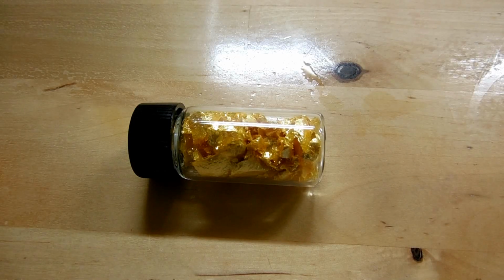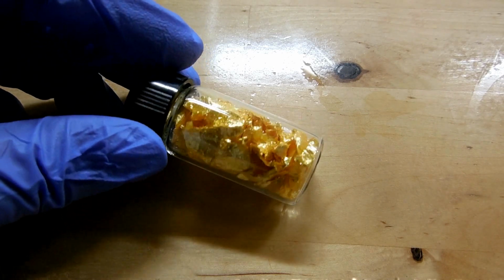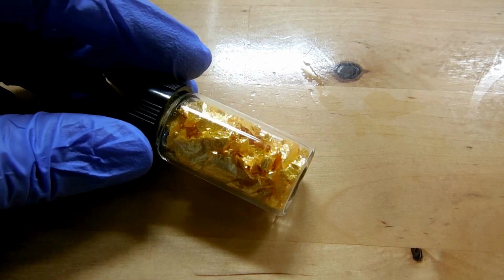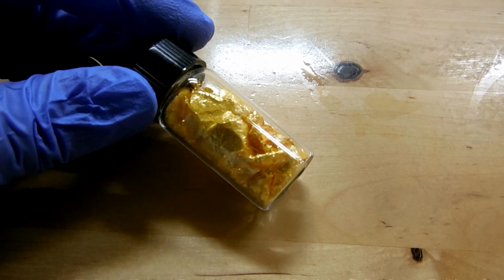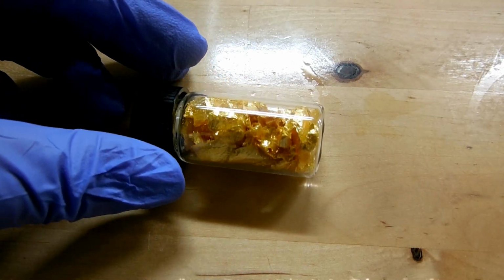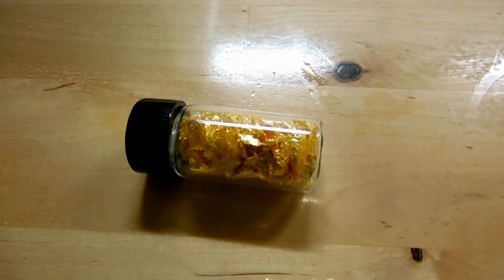So here's the final product, 0.8 grams of lead iodide. You can see it stayed together fairly well in these nice little sheets, and it looks a lot like gold leaf. I think if we had gold leaf right next to this, it would look maybe not quite as shiny or not quite as yellow, but it's very, very close, and that's pretty neat.